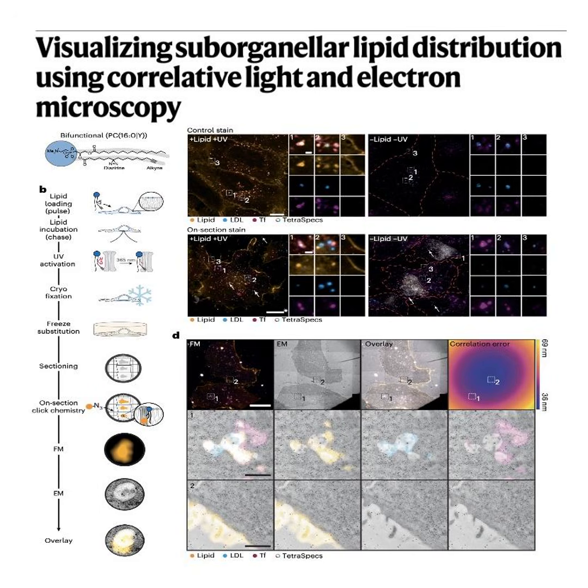I do have a broader methodology question, though. Sure. Why rely on click chemistry and fluorescent microscopes at all? If we are ultimately using electron microscopy to see the cellular roads, couldn't we just tag the stealth lipids with highly electron-dense gold beads? They would just show up organically as dark spots on the EM scan? It's a highly logical alternative. Yeah, it's called the nanogold method, and the researchers actually tested exactly that.